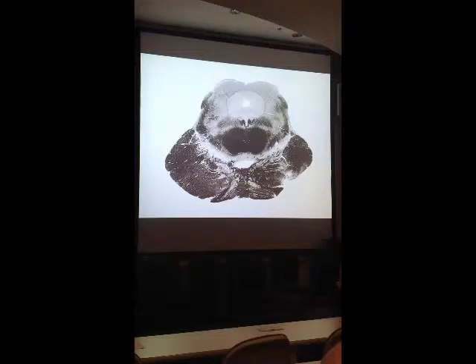And what goes along with both the inferior colliculi and the decussations is the cranial nerve nuclear pair, one here on the right and one on the left. These are a very small group of neurons, but they innervate only a single muscle of the eye. And what nucleus is this? This is the trochlear nucleus. So if I pointed to something like this, I'd probably just say, name the specific nucleus right here. Okay, that's the trochlear nucleus.